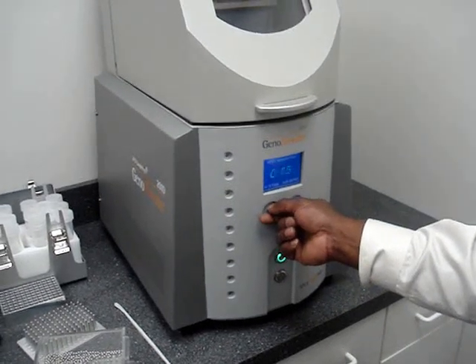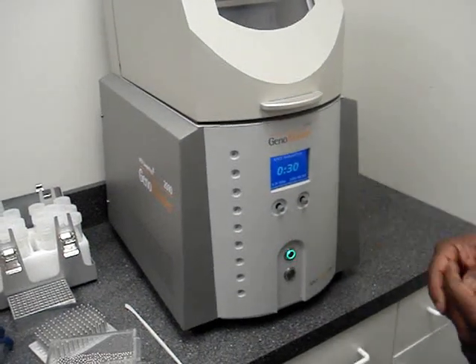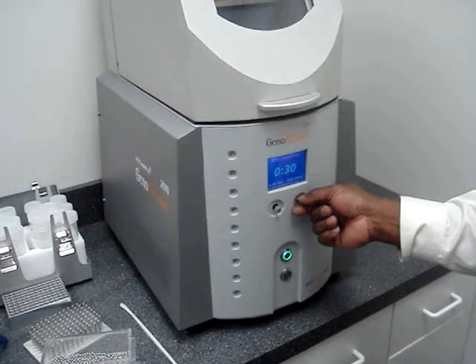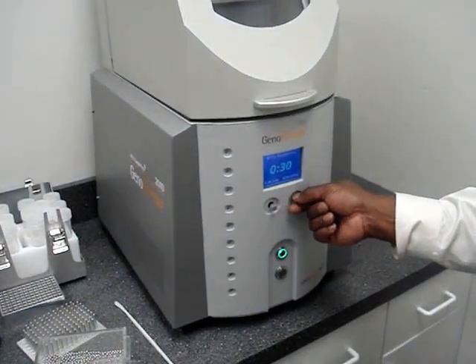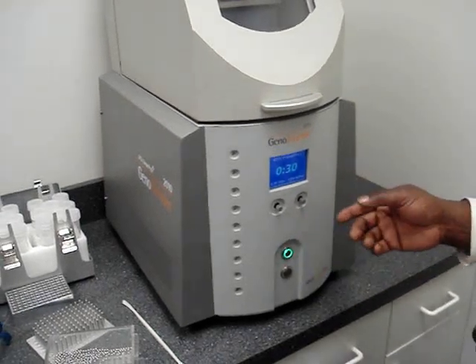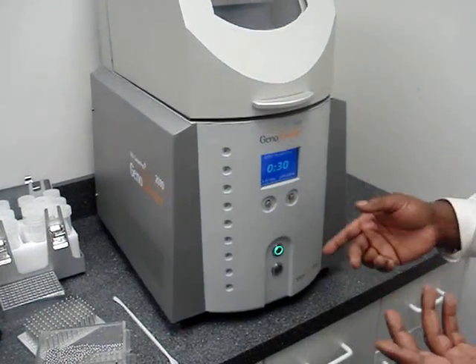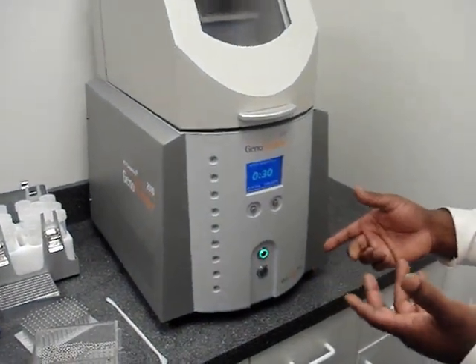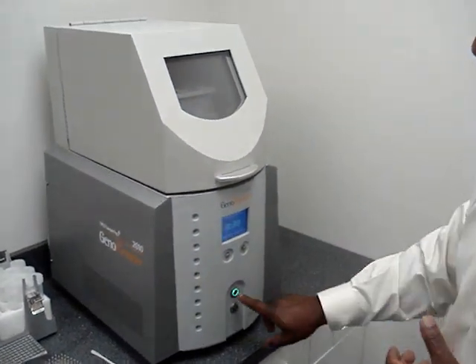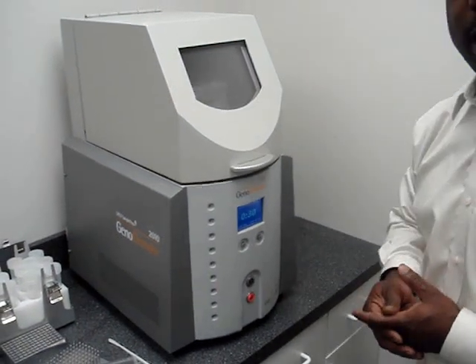This first exercise we're going to do is only going to last 30 seconds at 1,350 strokes per minute. That is easily adjusted as well with just turning the knob. Once you've had your parameters set into the Geno Grinder, you just push the button to lock everything in so that any user that comes in can put their samples in and push the button and start to go.